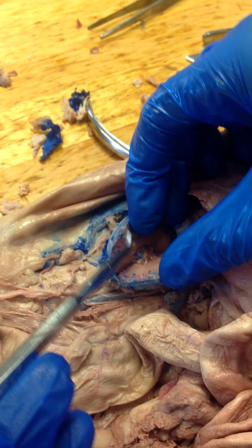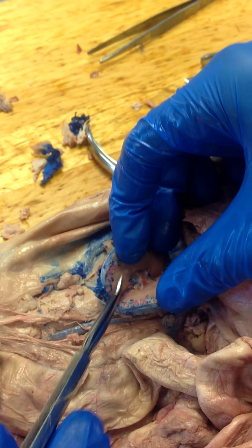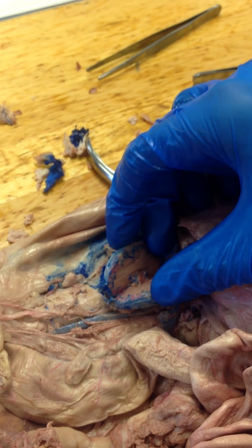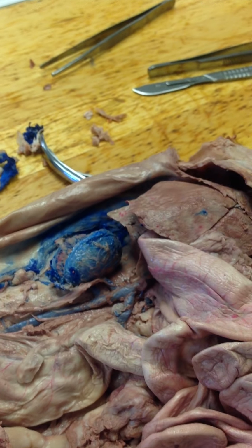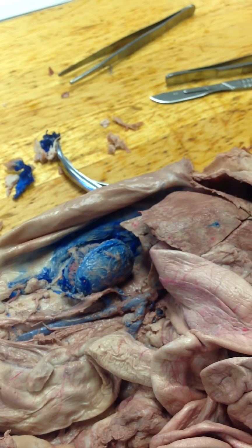Anyway, that's the internal side of a kidney. Oh, and the papillae and the medulla together make renal pyramids. Papilla and medulla, so it rhymes, equals pyramid. It's supposed to look like a pyramid, but I don't see it.